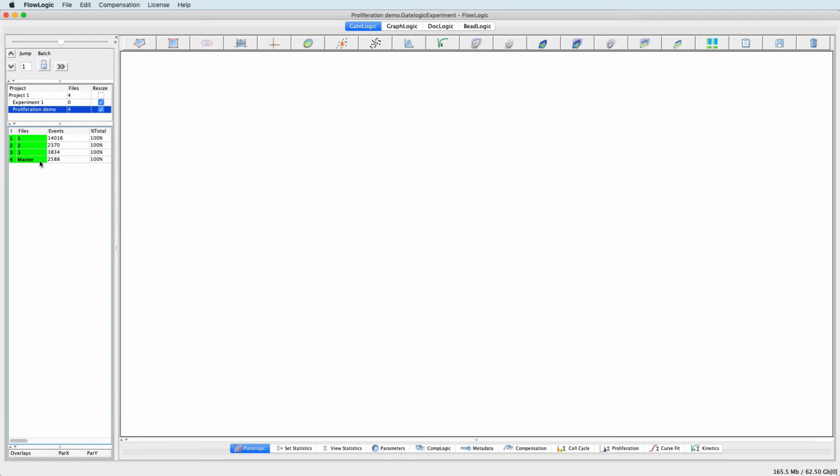However, it is possible to set a master or a universal first generation position, and this is done by grouping the generation 1 gates for each sample that defines the first generation peak. Also, when grouping a selection of existing gates, it is the gate that is listed highest in the file inspector that governs the position of all other gates in the group.